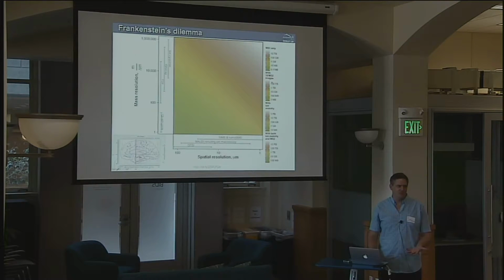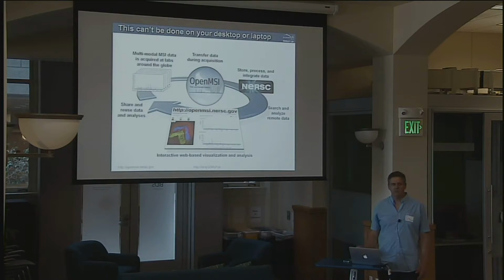You're probably going to take MS images also. You need to fragment those molecules to know the exact thing you're looking at, so you see an immediate blow up of the data. If you add ion mobility, and ion mobility with MS, you're in the petabyte regime for one file. Obviously no one is taking data like this, for lots of reasons, but I would say they could.